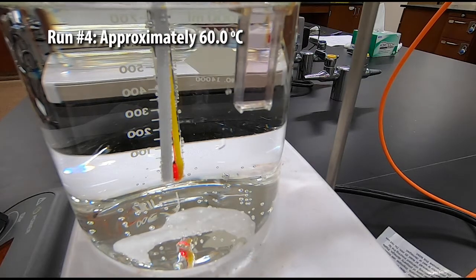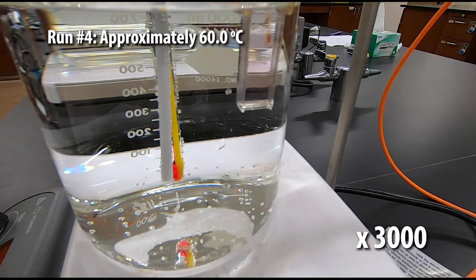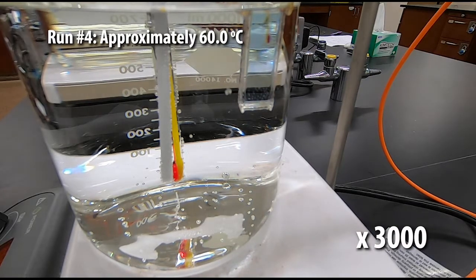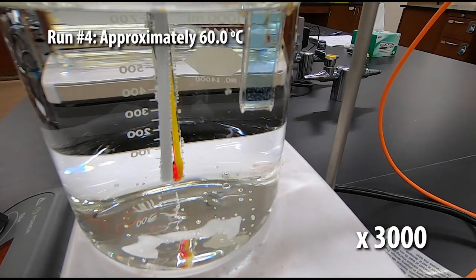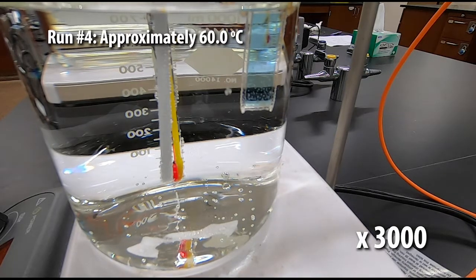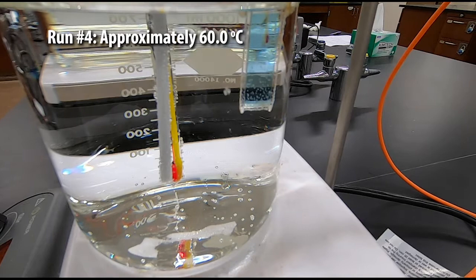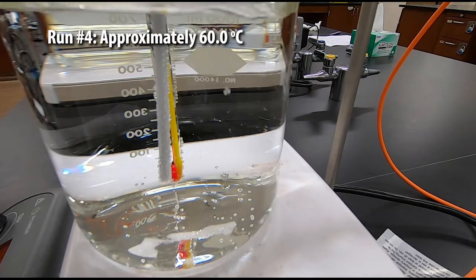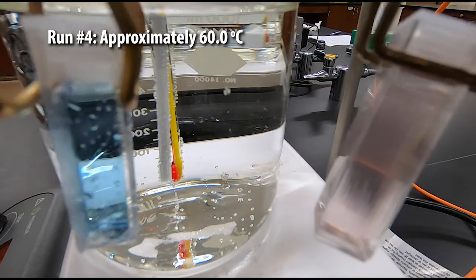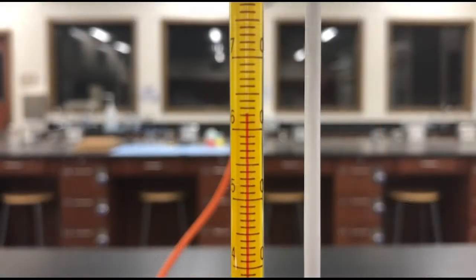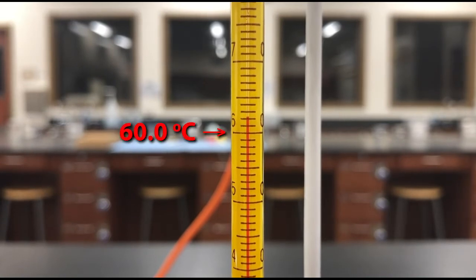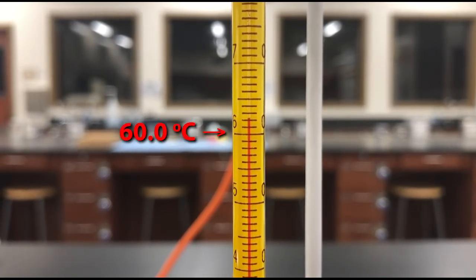Here's our third water bath which has an approximate temperature of 60 degrees Celsius. You can see as the temperature increases there's more of a dramatic shift in color. Go ahead and write down what the actual temperature is from this thermometer. The long line is 60 degrees.